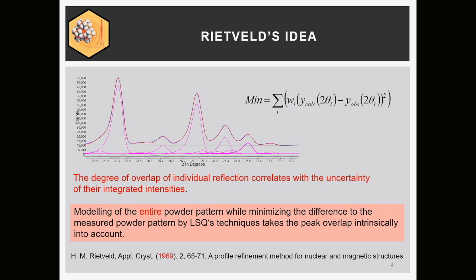And to get most of it out, you can use the Rietveld method by minimizing here the difference between the calculated powder pattern at each point minus the observed one. And then, of course, if you sum this up, it would give us 0, right? So it doesn't make any sense. So you only want absolute values. So you can either use the modulus, or what people in least squares do, they square it. But when you square it, and you don't do anything with the data, it will also not really work.